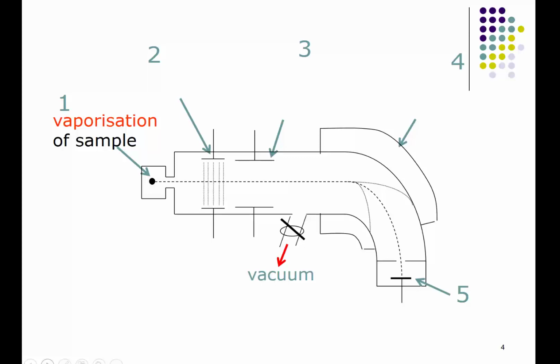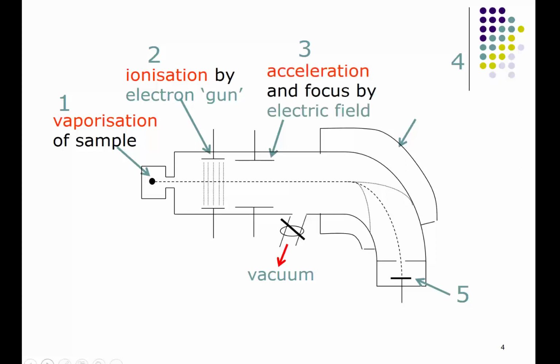The sample is then bombarded by an electron gun that projects a stream of high-energy electrons. The goal is to knock out a single electron from each of the atoms, thereby ionizing them to a unit charge. The power of the electron gun is set so that the majority of the ions that are produced will have a +1 charge. These cations are then accelerated down a tunnel. A vacuum is applied to the tunnel so as to minimize interferences from other gaseous molecules, such as molecular nitrogen and molecular oxygen found in air.